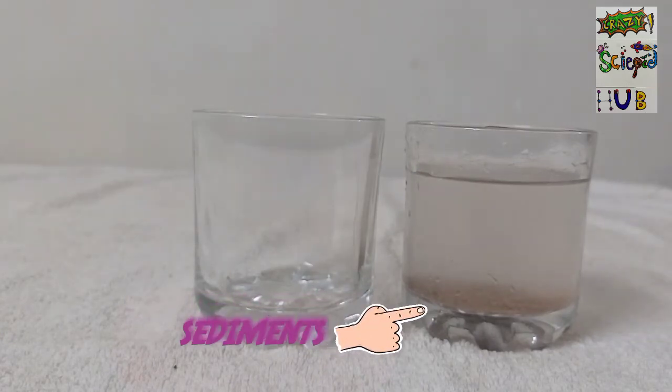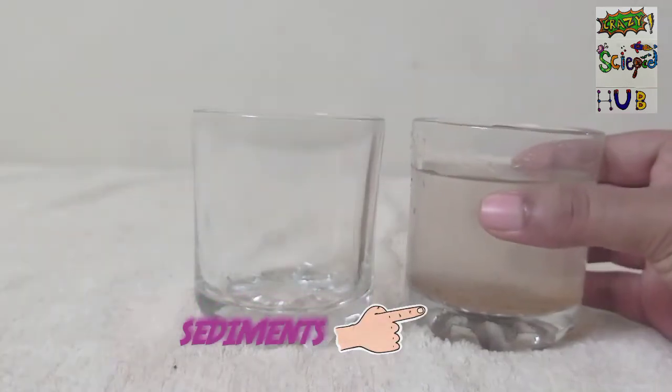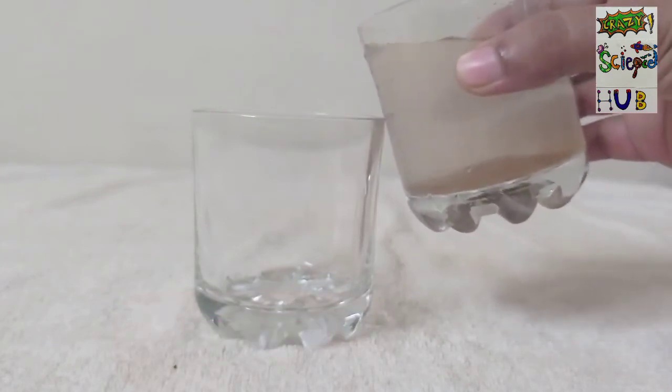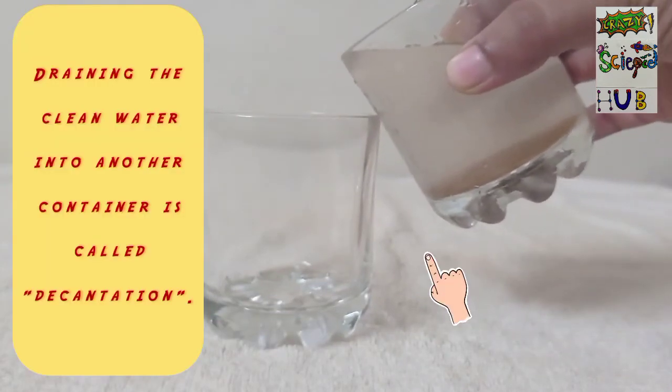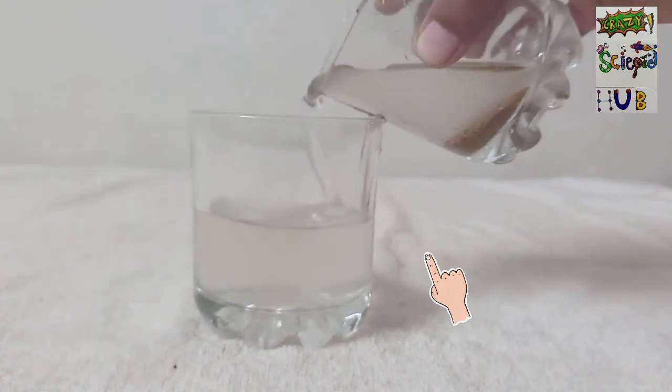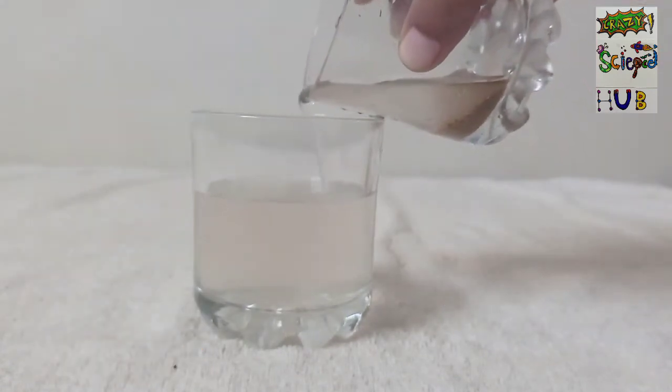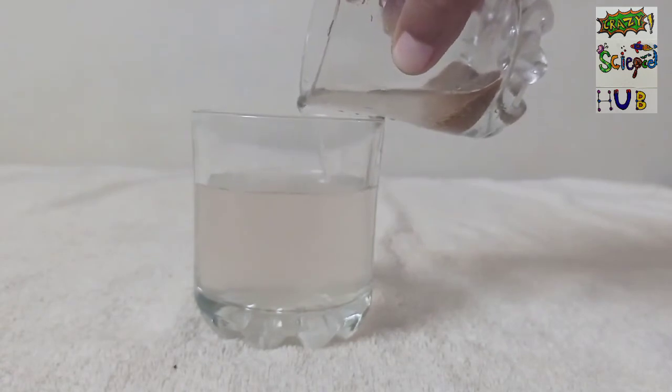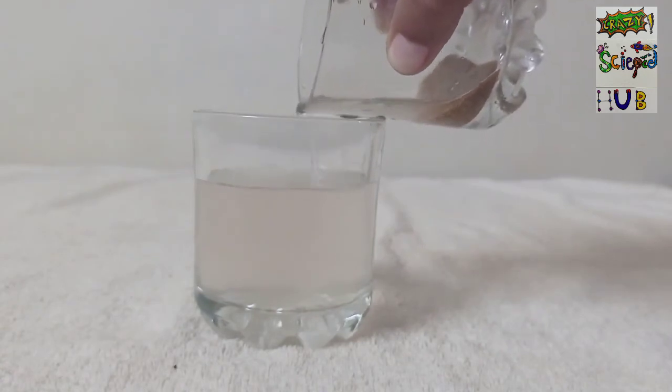Now we are going to pour this strained water into another container. This process is called decantation. Without disturbing the sediments, we have to pour the water slowly into the another beaker.